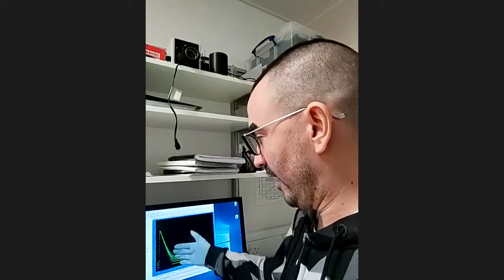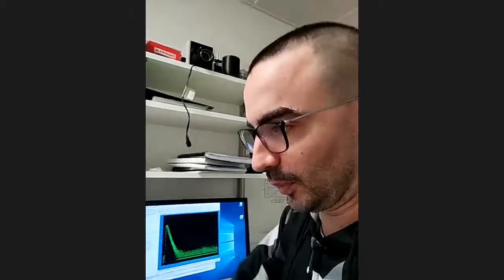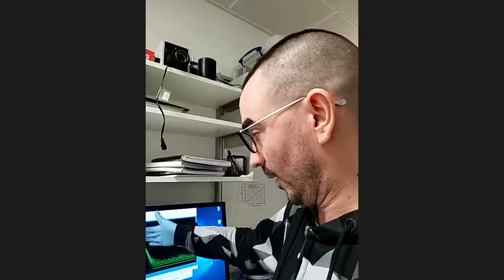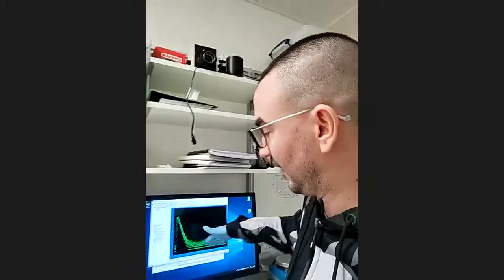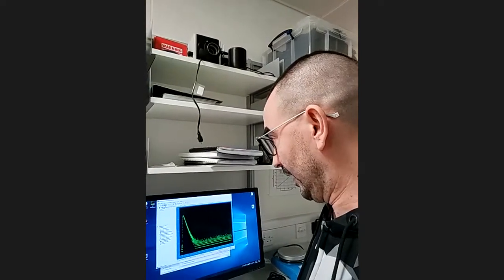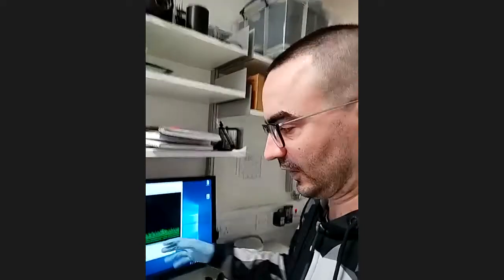right? So if I was to change the protein, it would have a different decay rate if I put a different protein in there, or if I was to heat the protein up and it was to denature, then you just get a mathematical description that involves an exponent, and the number that you would get from fitting that would be different, right? So this is the key principle that underlies, I mean, that's done now, that's just underlying how you would measure fluorescence decay, right?